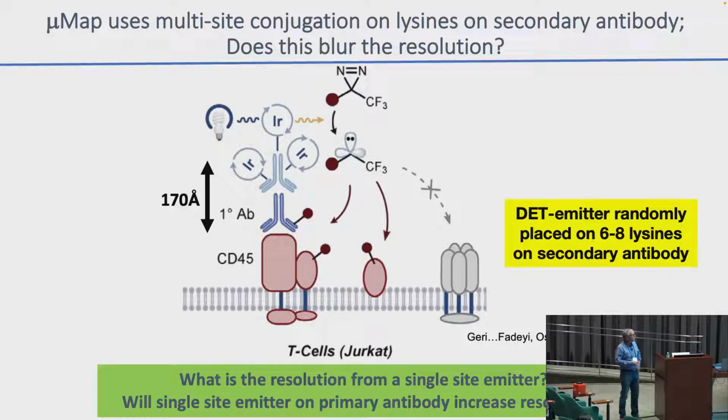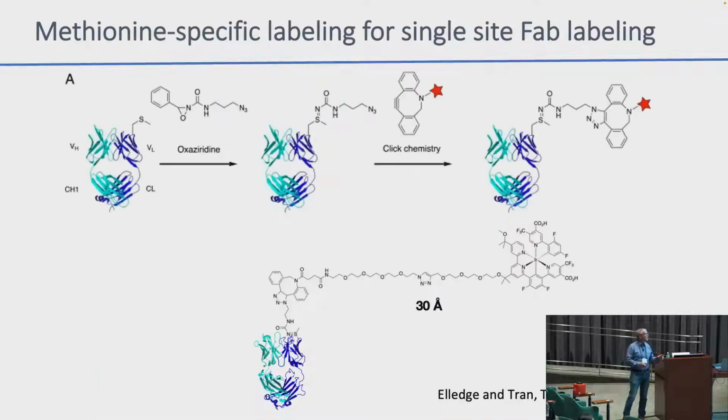And so we wondered, what is the resolution from a single site emitter? Will single site emitters on primary antibodies, in other words, if you put it up here, increase the resolution, and what would be the results that you would get?